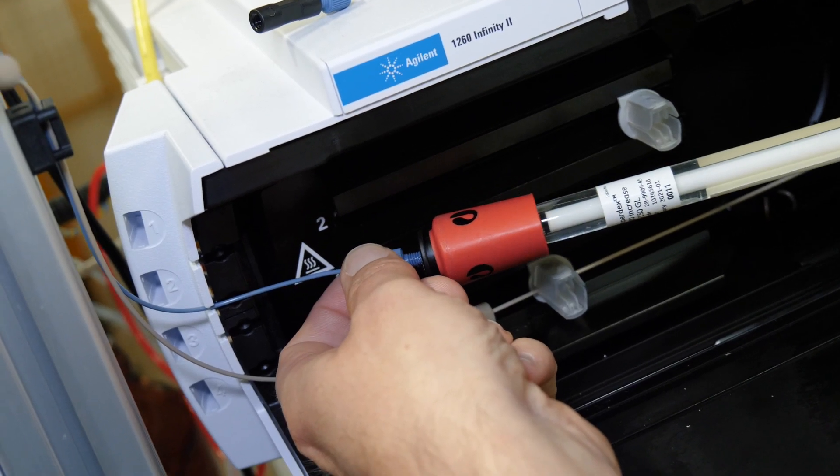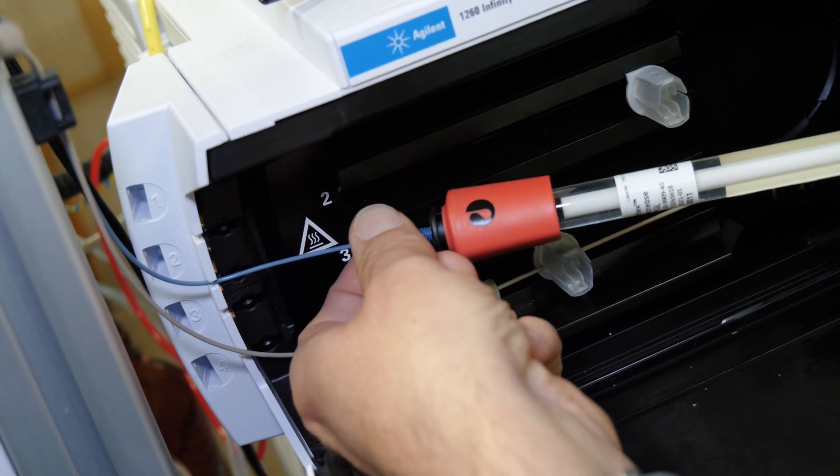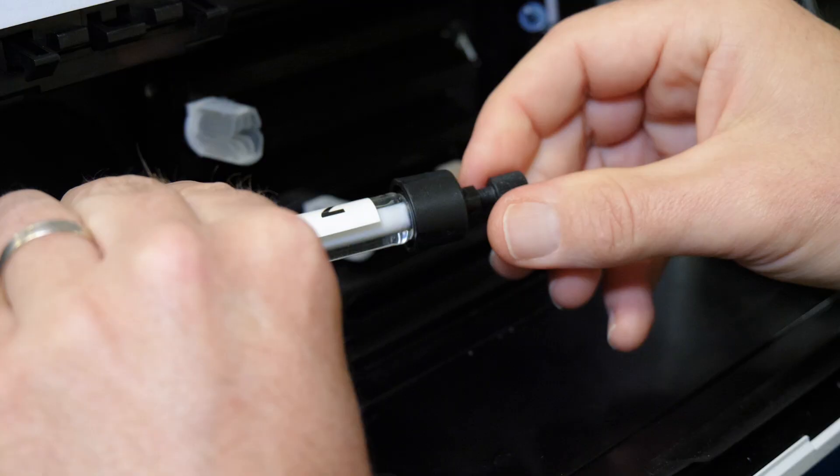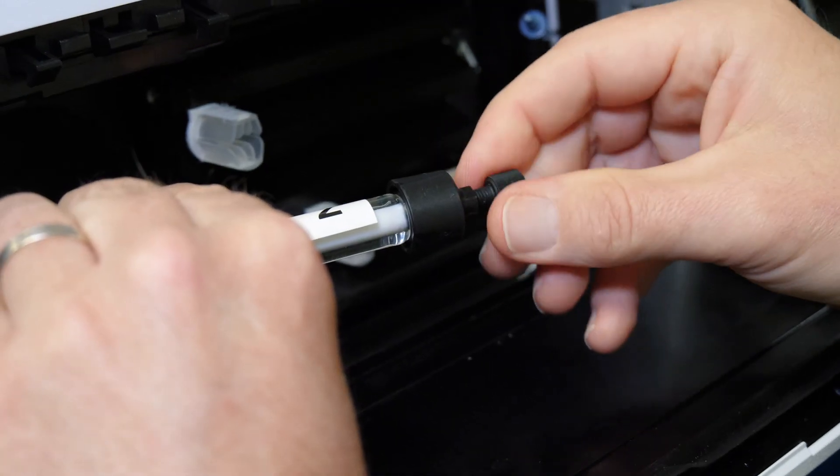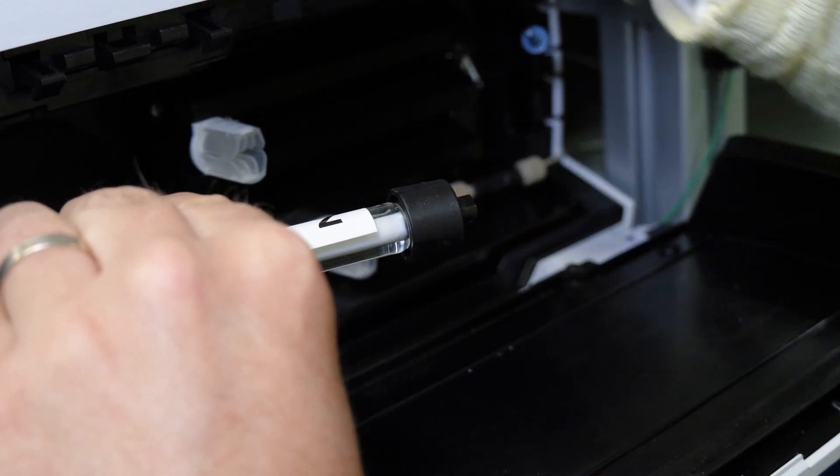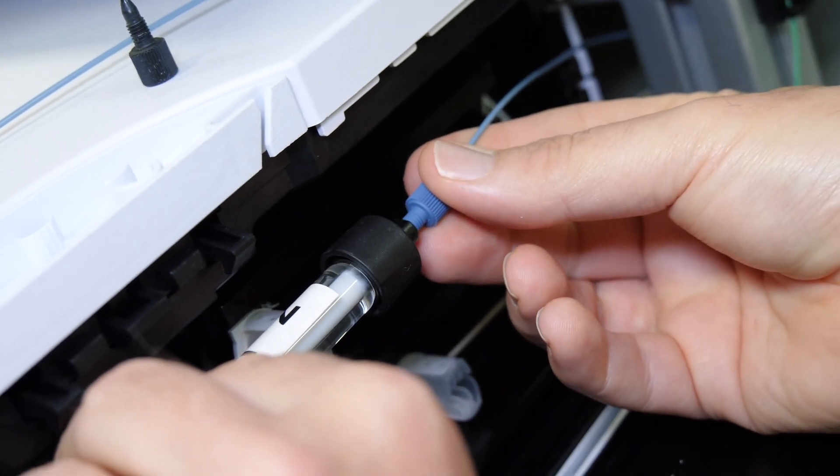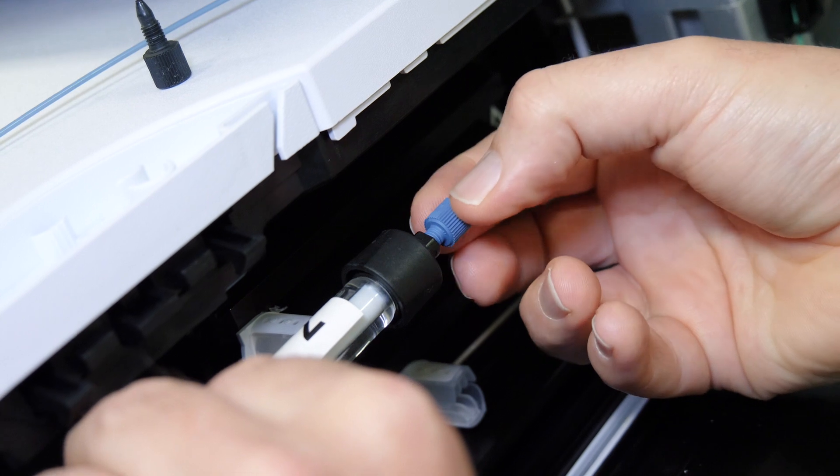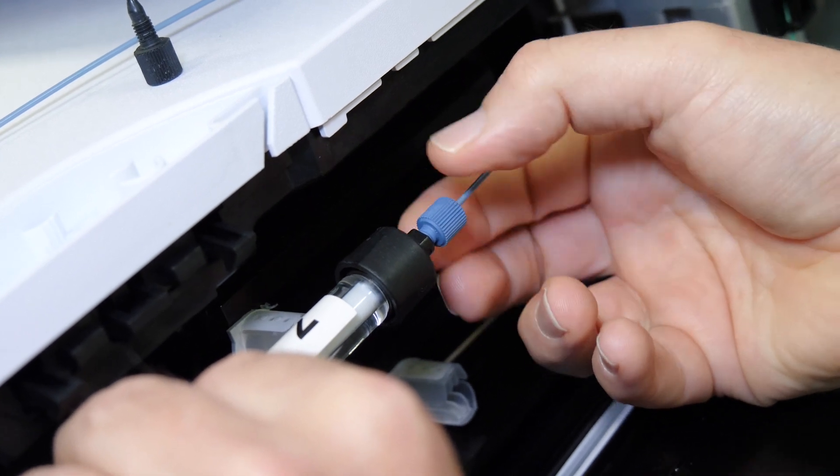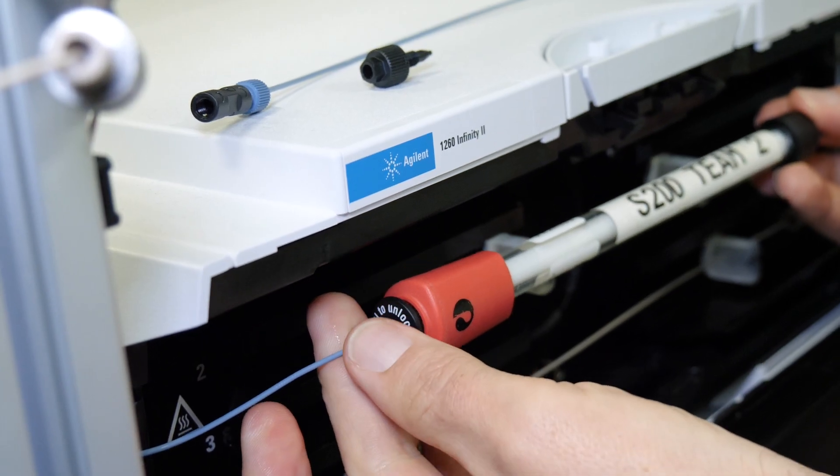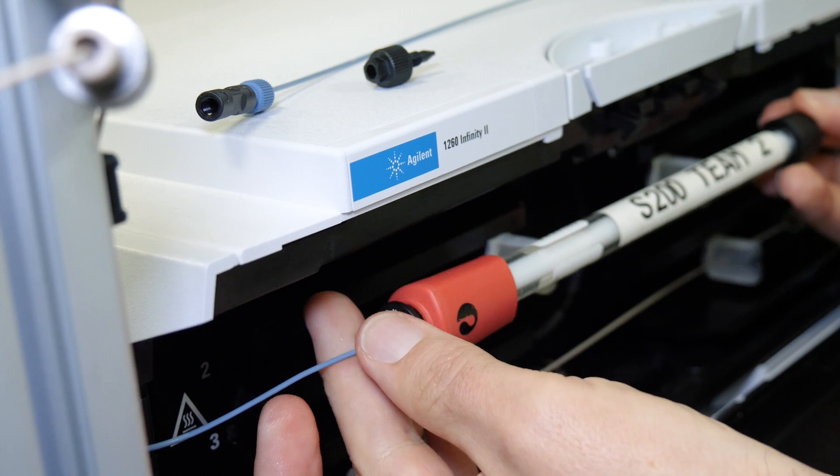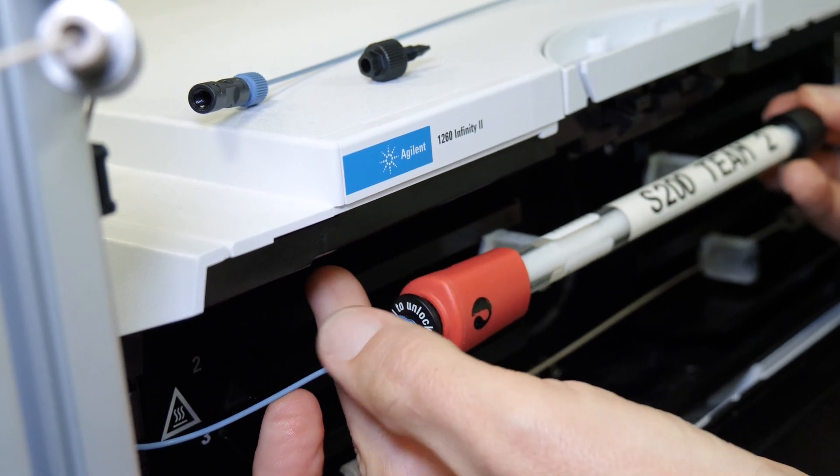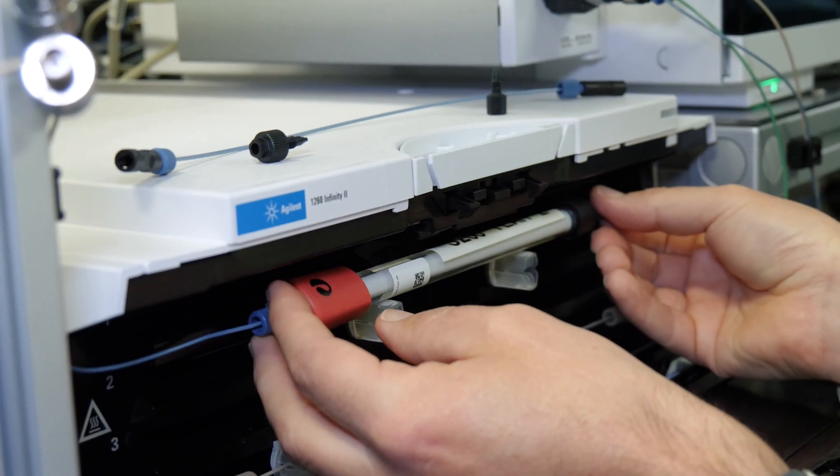To avoid air bubbles, screw up only to halfway the connector in the column inlet. Then screw completely the connector in the column outlet. Finally, screw completely the connector in the column inlet.